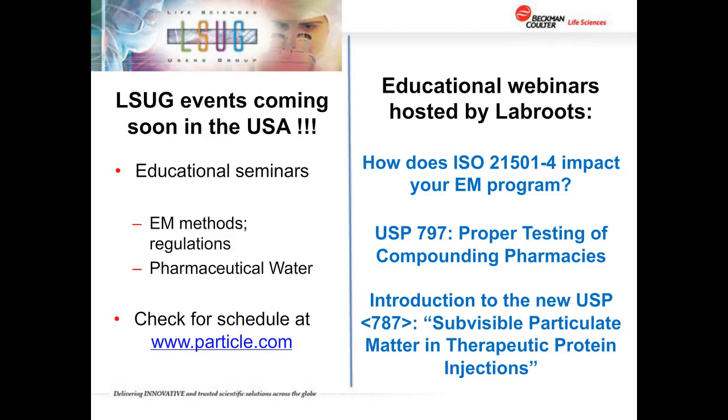It doesn't think of it as viable or not, and it just says there's one of those, it counts it. So the table is really, you could say, non-viable particles, but I think a better phrase would have been total. And if you notice in the document, it doesn't use either phrase in discussing that in the ISO document. It just says airborne particulates.